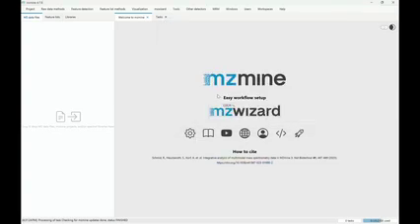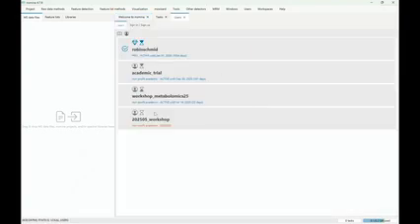Then you can close this, and the start is that you have to make a user account. If you open this, you're going to see a couple of users already for me, and maybe for you, you already get a login screen where you have to create a user account. If you do that with your academic email address, you're going to get a free academic license directly.